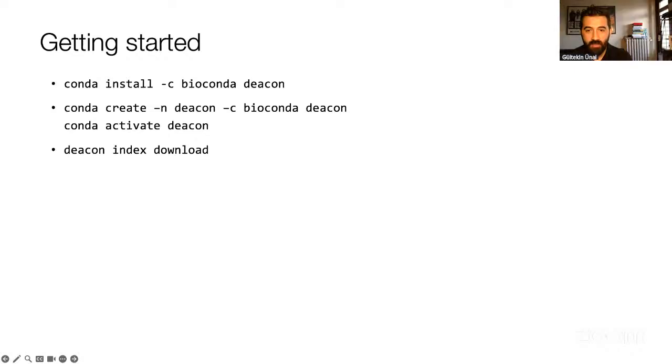I skipped Sam's question, which is, would you suggest using Deacon for a targeted sequencing experiment versus direct mapping to your target organism? Targeted, so that's when you want to retain one thing. Yeah, I guess if you use alignment, you will be more sensitive. K-mer approaches will never be as sensitive as an alignment-based approach, but in some situations that can be an advantage.